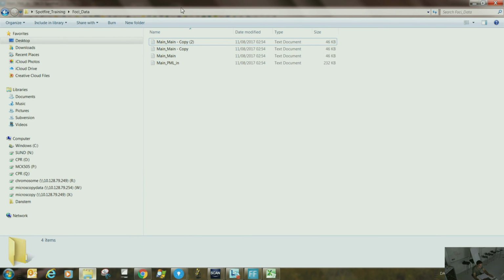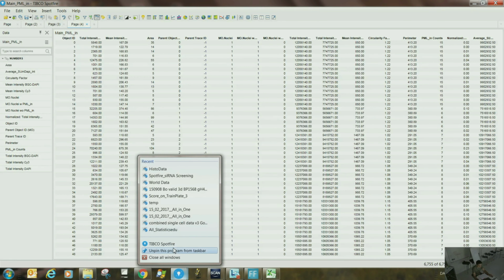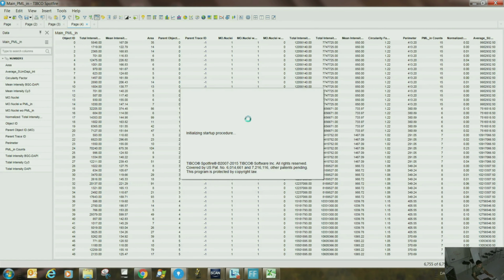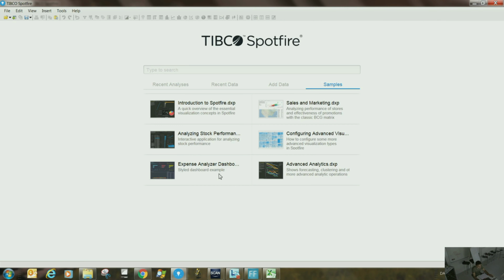So the way you do it is go to Spotfire again. I will open one more. Actually, this is very interesting because for this you have to use labels and also concatenate at the same time. So for this one, you open first this file, main file.